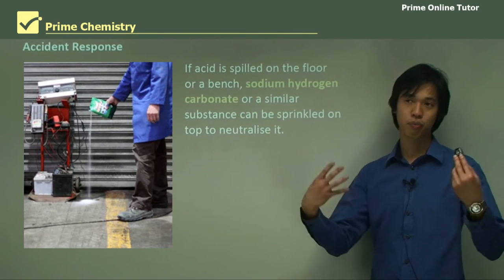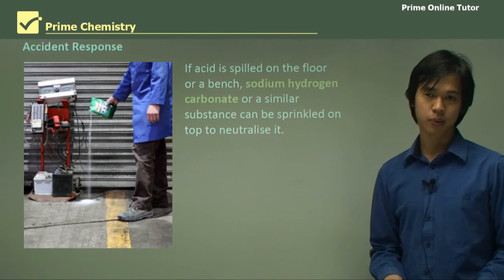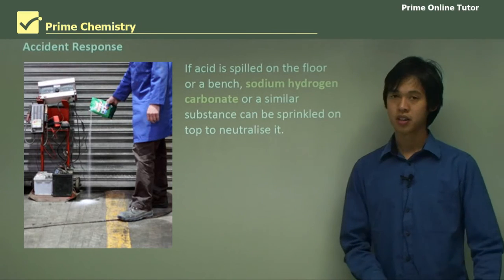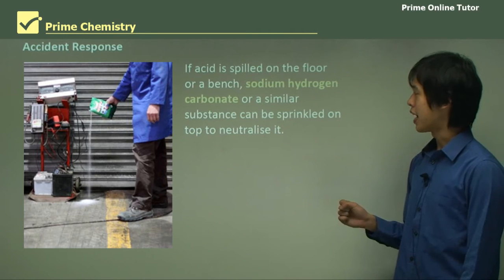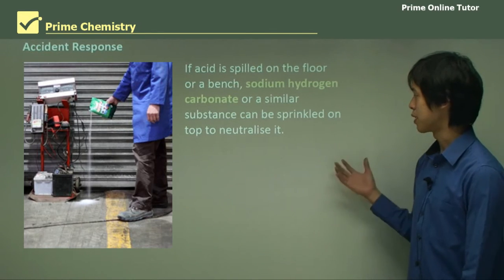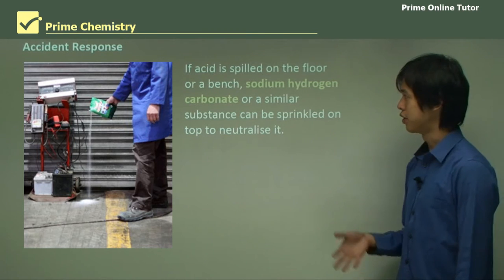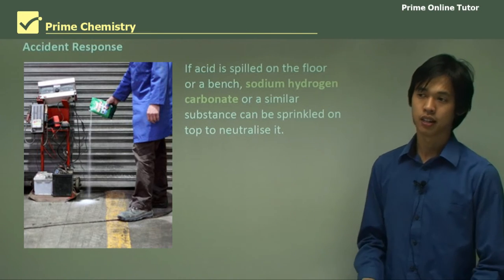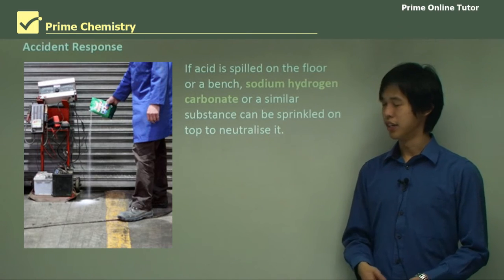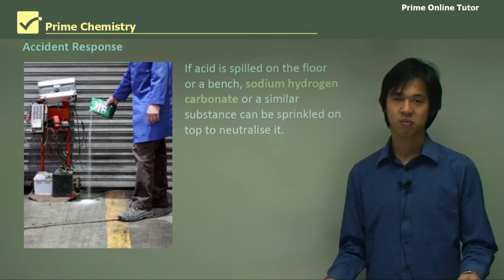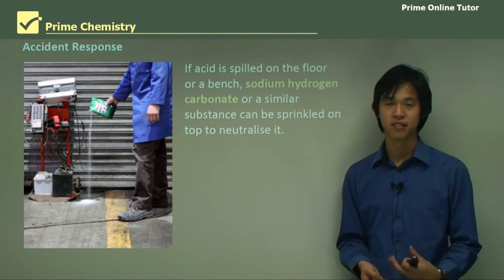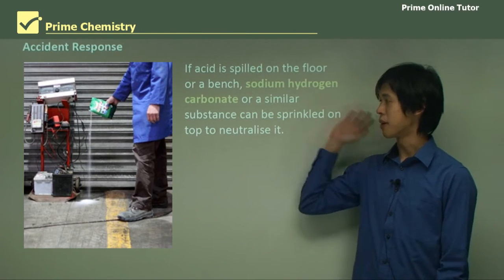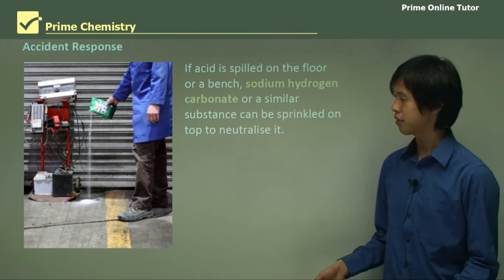Now that we've protected ourselves, we need an accident response protocol, because humans make mistakes. If acid is spilled on the floor or on the bench, sodium hydrogen carbonate or a similar substance can be sprinkled on top to neutralize it. You could use sodium hydrogen carbonate, baking soda, or sodium bicarb — or you can use sodium carbonate. Just not something like sodium hydroxide, where you'd have a huge release of heat from the acid and base mixing together. Sodium hydrogen carbonate or sodium carbonate would be fine.